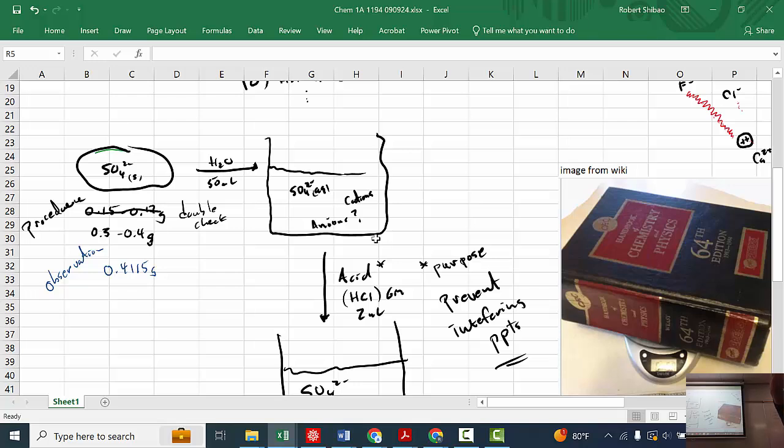It's going to reabsorb it, because this is humid air. This is what, 20–30% humidity, something like that. And so if this cools down, the surface water will reabsorb, and then water will work its way back into the crystal, create a hydrate. And so what we have to do is we have to protect this from reabsorbing water.